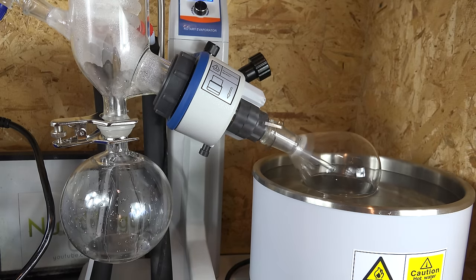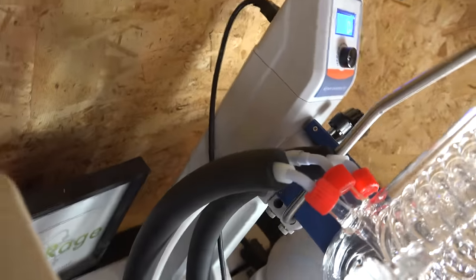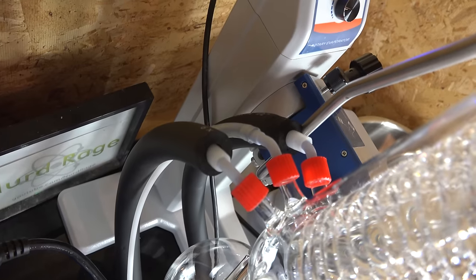To further compound the speed advantage, most rotovap systems use a vacuum to lower the air pressure and thus lower the boiling point of the solvents being removed. With a lower boiling point it's easier to boil off solvents, and this is especially important when boiling off solvents that have higher boiling points than water, like xylene and toluene. The water bath can only heat up to near the boiling point of water, so a way to reduce boiling points below that is tremendously important. You can see the condenser connected to two insulated water coolant lines, and in the center is the vacuum line.